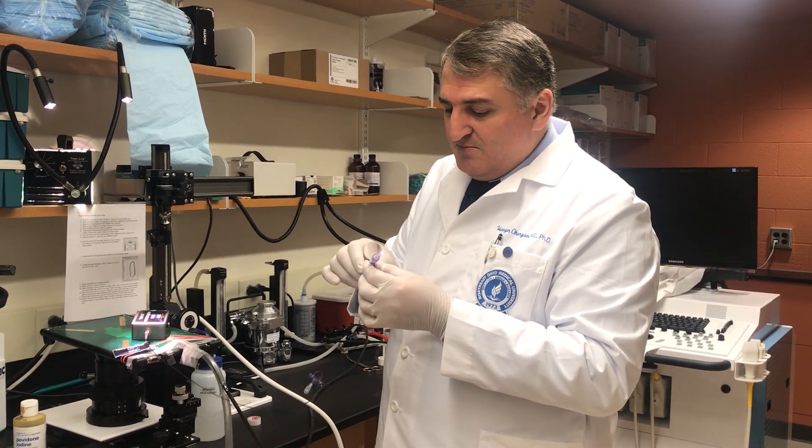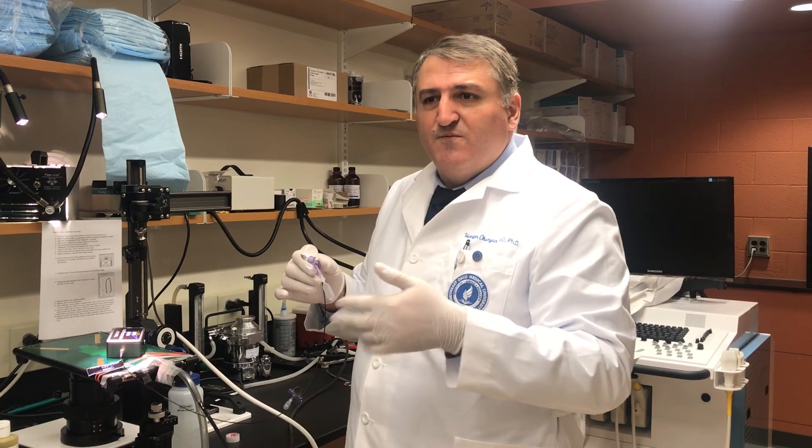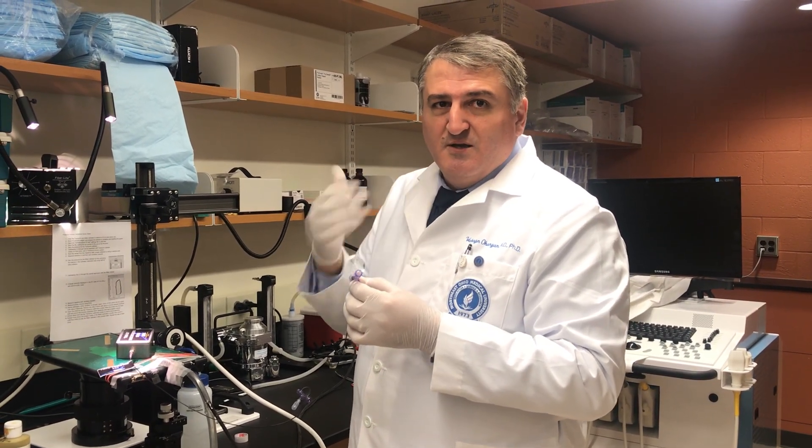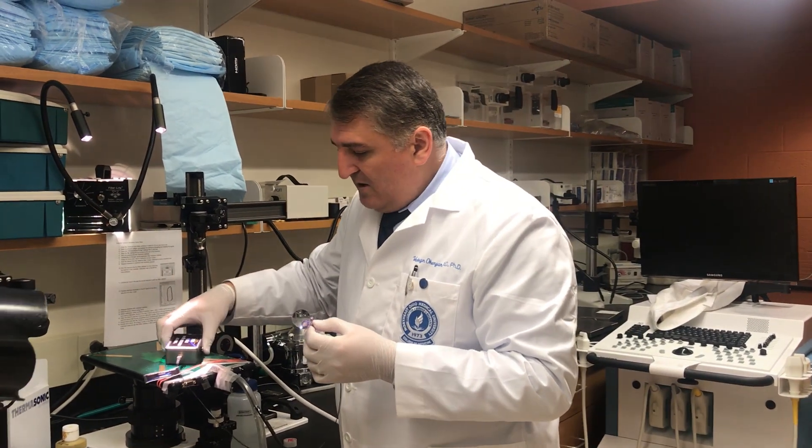We do three attempts based on clinical application — like even for humans, if after the third attempt we fail to intubate, we use the nose mask. Because even if on the fourth, fifth, or sixth attempt you are successful, the animal will not survive. We are irritating the trachea and vocal cord, causing damage.